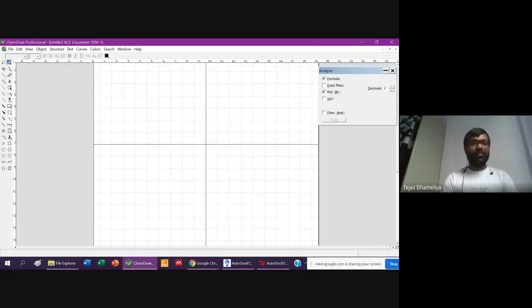So I have opened ChemDraw, which is another software essential for this. I'm drawing some structure here.